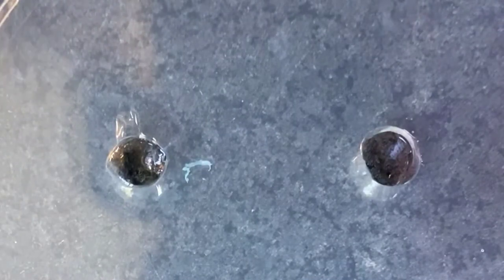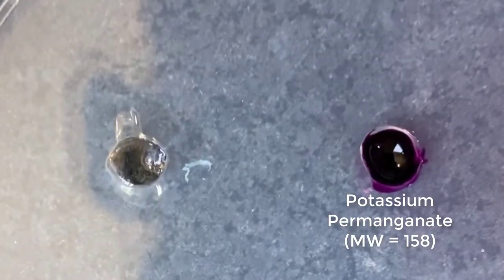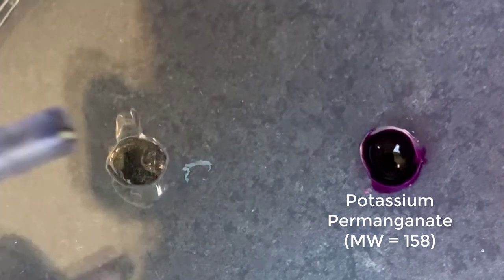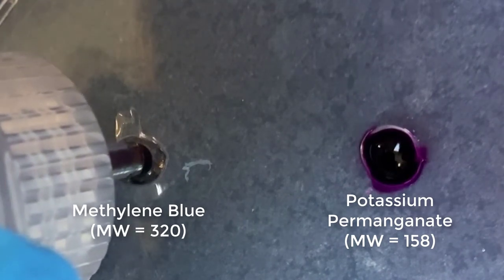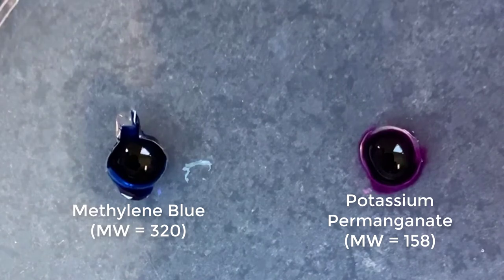Now we have two cavities. On one side I'm going to be adding potassium permanganate, which has a molecular weight of 158 and is a beautiful purple color. On the other side I'm going to be adding methylene blue, which has a molecular weight of 320 and is blue.